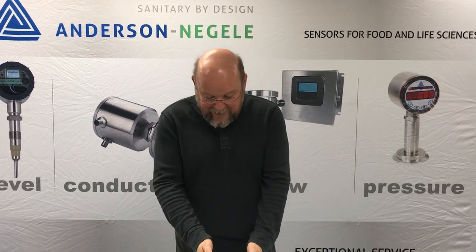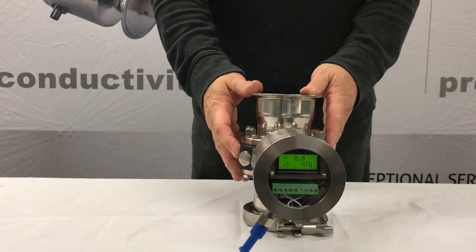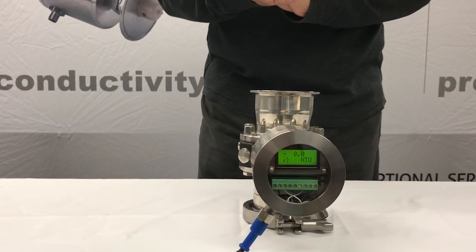What I have in front of me is an ITM-4, and that is filled with clean water, and as you can see it's indicating a very low measurement — I'm probably reading 0.0 NTUs.